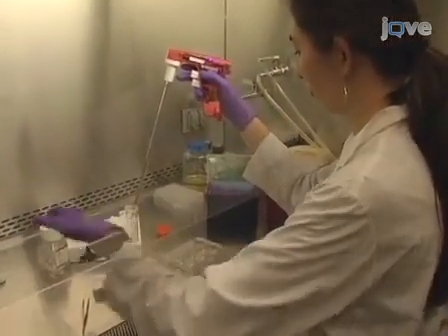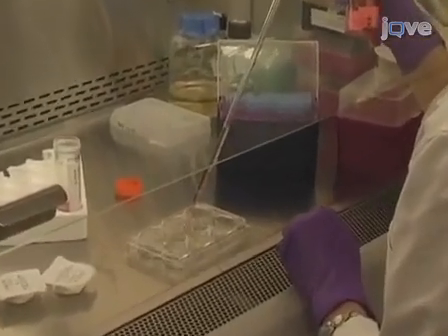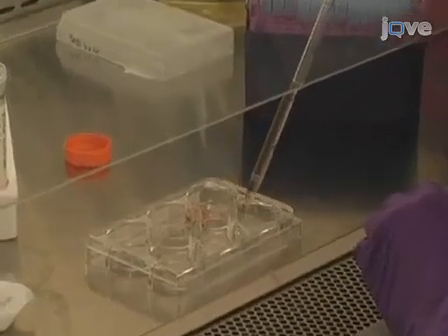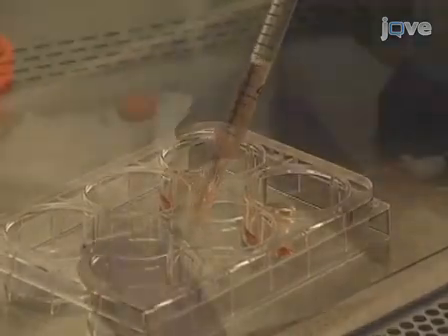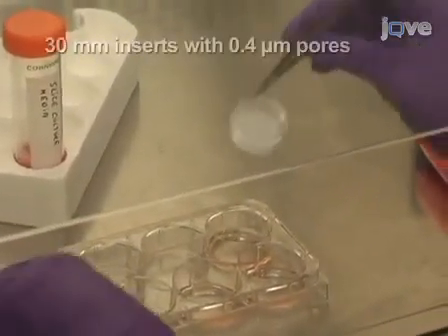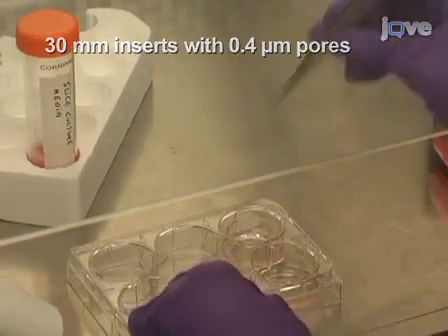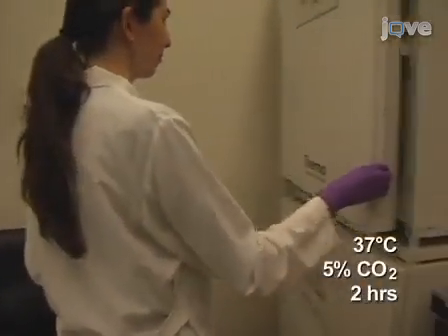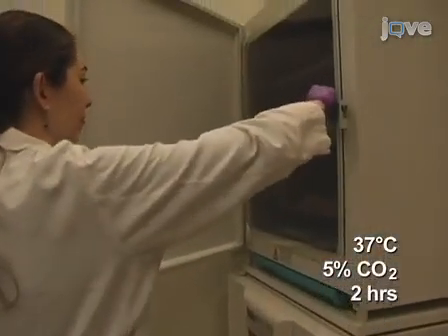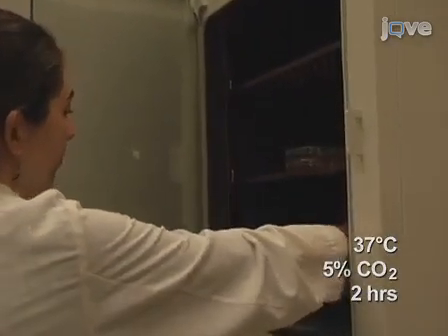On the day of dissection, prepare tissue culture plates for culturing the cerebellar slices. Add 1 milliliter of slice culture media to each well of a 6-well plate. Then, use sterile forceps to place the culture plate inserts into each well. Ensure that there are no air bubbles trapped beneath the insert. Place the culture plate in a tissue culture incubator set at 37 degrees Celsius and 5% carbon dioxide for at least 2 hours to precondition the media.